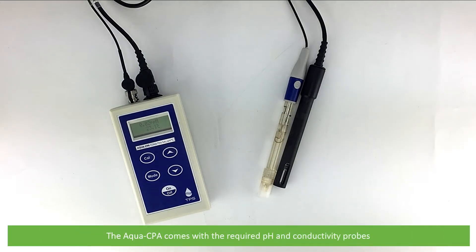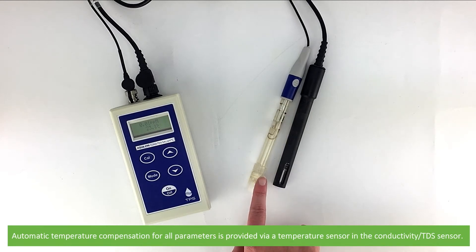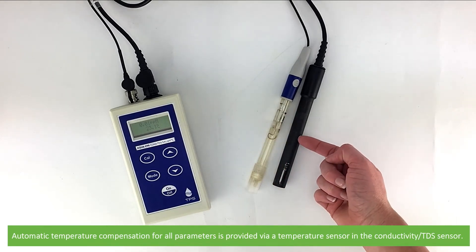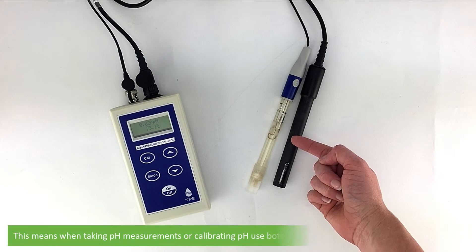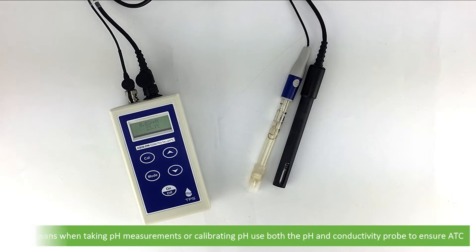The Aqua CPA comes with the required pH and conductivity probes. Automatic temperature compensation for all parameters is provided via a temperature sensor in the conductivity sensor. This means when taking pH measurements or calibrating pH, use both the pH and conductivity probe to ensure ATC.